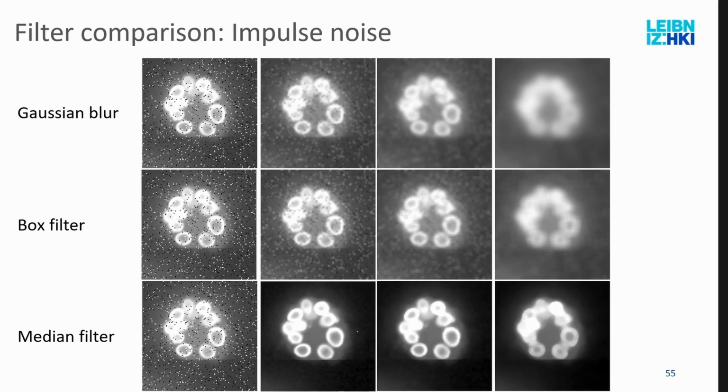And this is why I explain so many different filters, because you have to choose which one works best for your use case and what you intend to do with the image later on. Sometimes, as mentioned before, you explicitly blur away structures because you are not interested in these individual cells here, but you want a cluster specifically. This way it can blur away any structures that might ruin your further analysis and just, okay, I care about the general area.